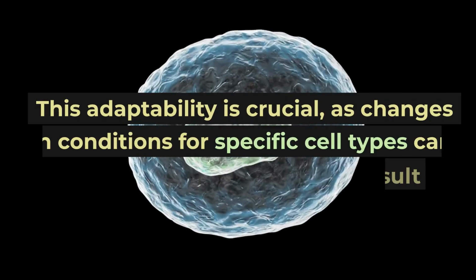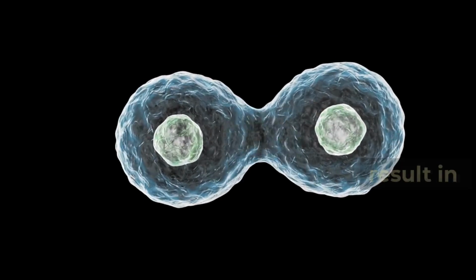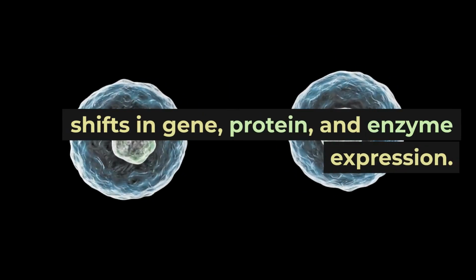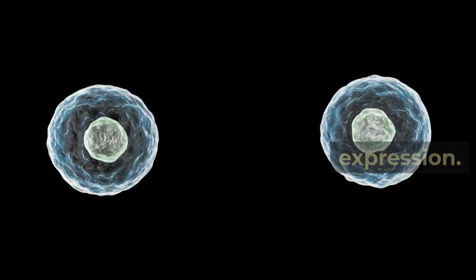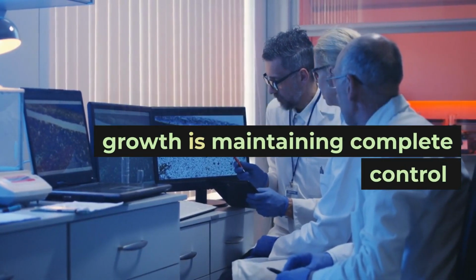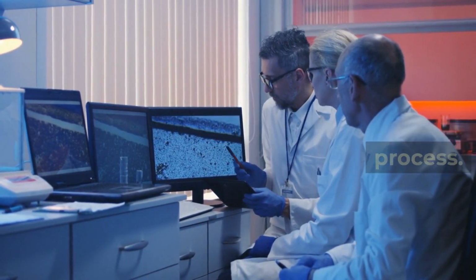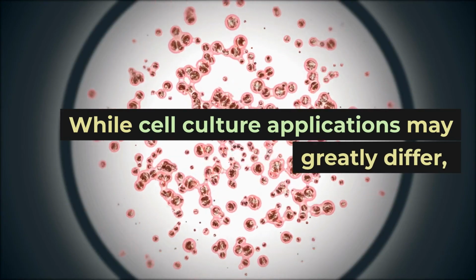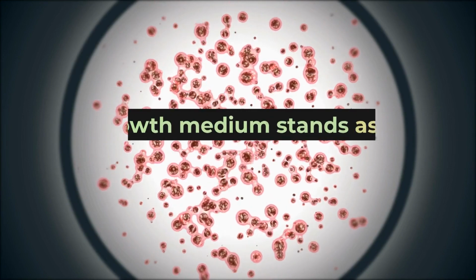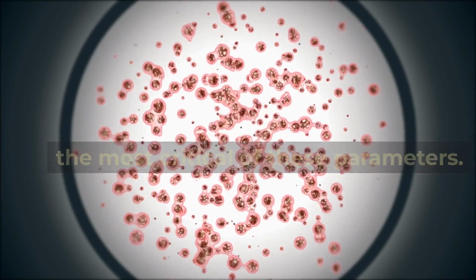This adaptability is crucial, as changes in conditions for specific cell types can result in shifts in gene, protein, and enzyme expression. One pivotal aspect of in vitro cell growth is maintaining complete control over parameters throughout the process. While cell culture applications may greatly differ, the growth medium stands as one of the most critical of these parameters.